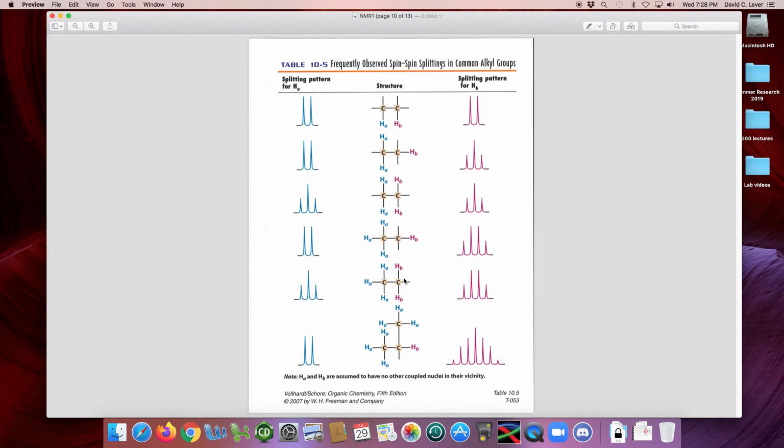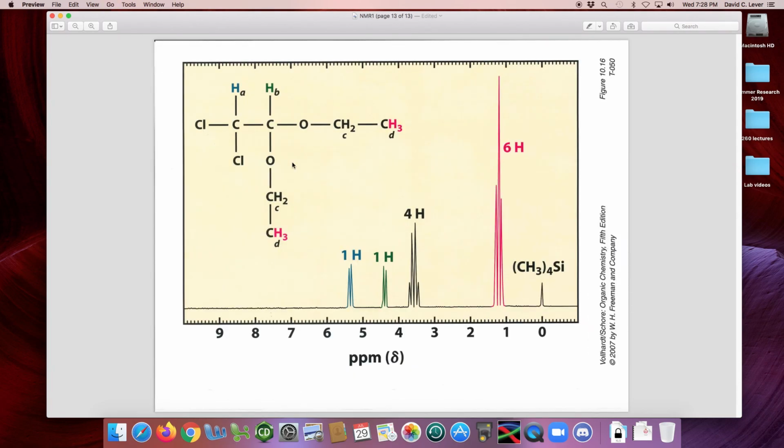The way to make the final structure would be to attach the ethoxy group, right? Attach both the ethoxy groups here and attach both the chlorines there. If I attach 1 ethoxy group and 1 chlorine on this side, and 1 ethoxy group and 1 chlorine on this side, I would have a plane of symmetry down the middle, which means these 2 hydrogens should not be magnetically different. So the structure indeed has 2 ethoxy groups attached to the 1 carbon and the 2 chlorines attached to the other carbon, so there's no symmetry between hydrogen A and hydrogen B, right? Those show up as magnetically distinct. They're splitting each other. There's not free rotation, so they're splitting each other with a smaller coupling constant, and then these 2 CH2s reflect into each other, these 2 CH3s reflect into each other. So I have 4 hydrogens that show up as a quartet and 6 hydrogens that show up as a triplet.